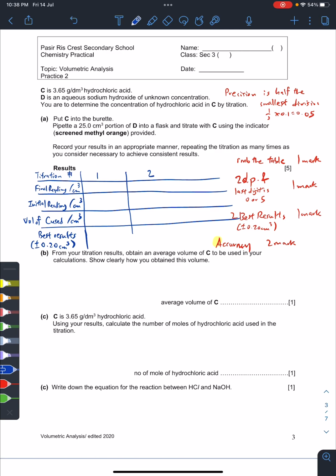So pause ready. Okay, paused. Okay, now you finish ready. You can now refer. So let's refer. So let's say my value here is 23 point, okay, these values are not the real values. You look at what is your own value. 23.15, 23.00, 0.00, 23.15, 23.00. Hey, still best result.